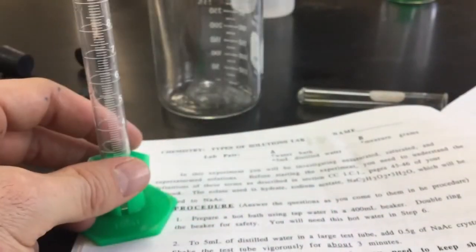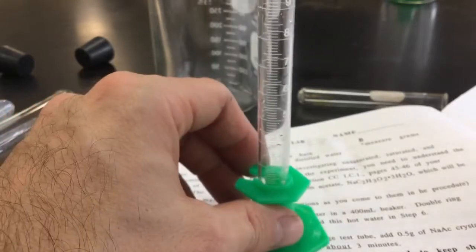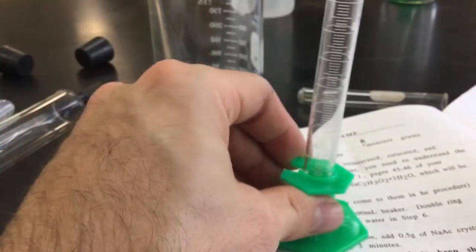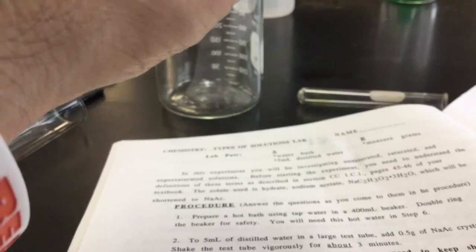So as you look over the steps in your lab, this is page 28 on your lab, or page 32 on your iPad. The first couple steps talk about getting exactly 5 mils of distilled water. I'm going to read the bottom of the meniscus there, and you can see I'm pretty close to 5.